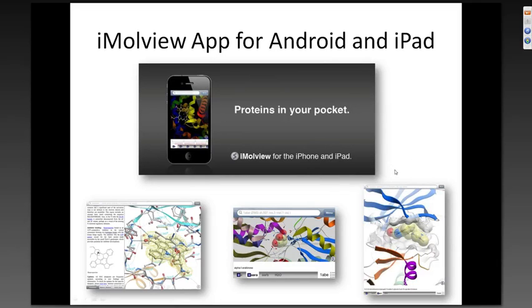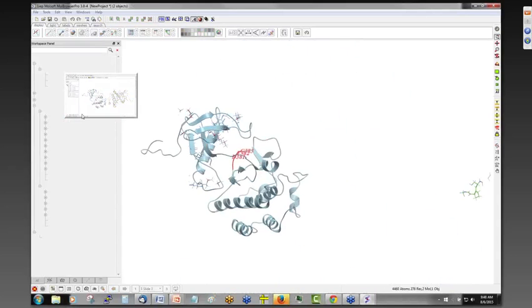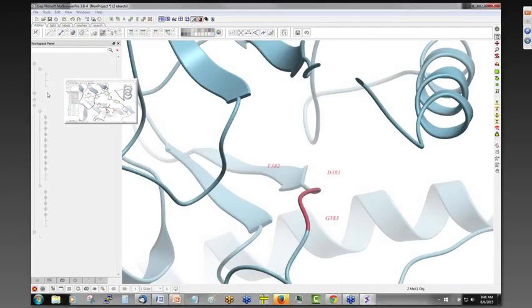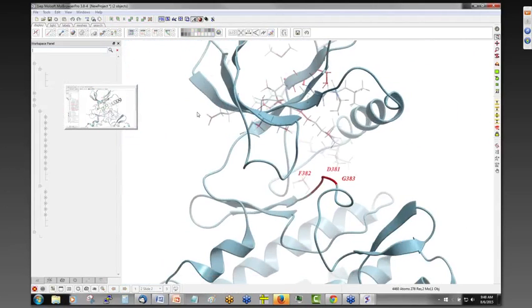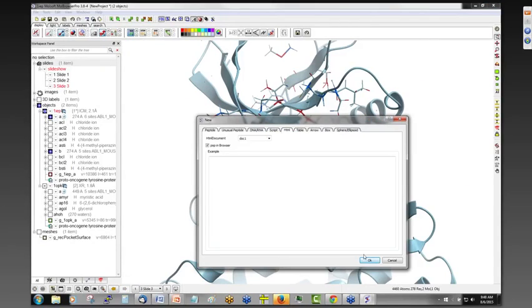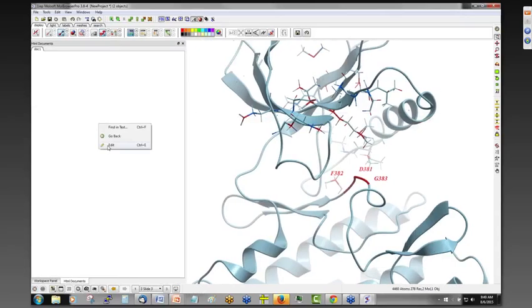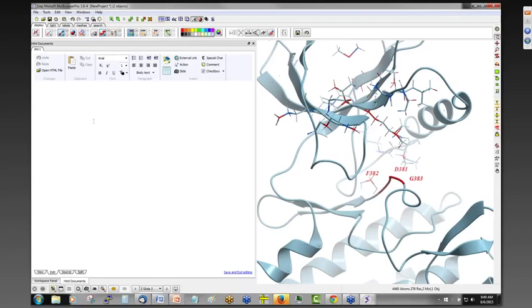So how to make these? As I mentioned, we made this slideshow before, all about our Gleevec and type 1, type 2 pockets. That's the DFG. So we can annotate this file. We go File, New, and build an HTML panel here, and we can edit this panel. So this basically brings up a sort of Word document environment to type and add things.